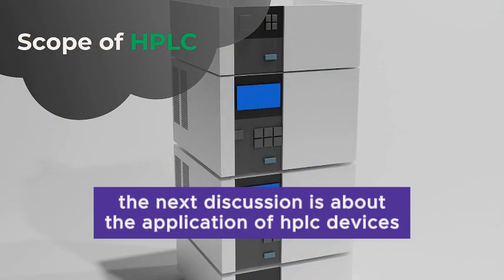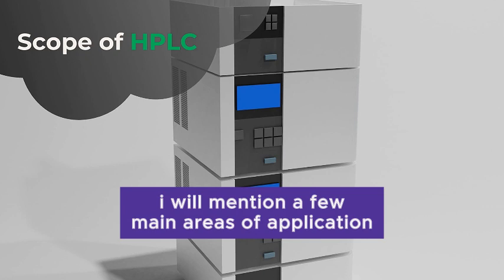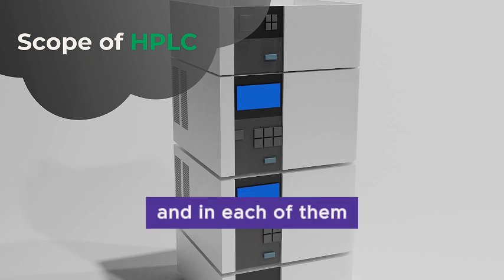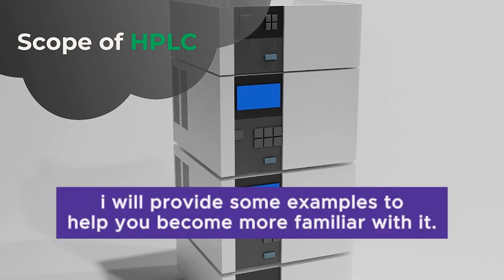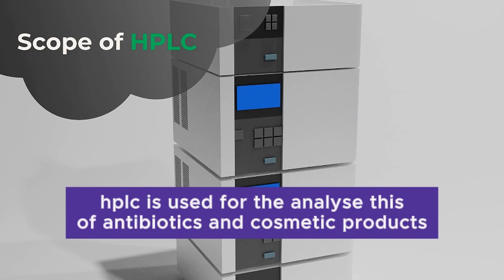The next discussion is about the application of HPLC devices. We want to know where they are used. I will mention a few main areas of application, and in each of them, I will provide some examples to help you become more familiar with it. In the pharmaceutical industry, HPLC is used for the analysis of antibiotics and cosmetic products.